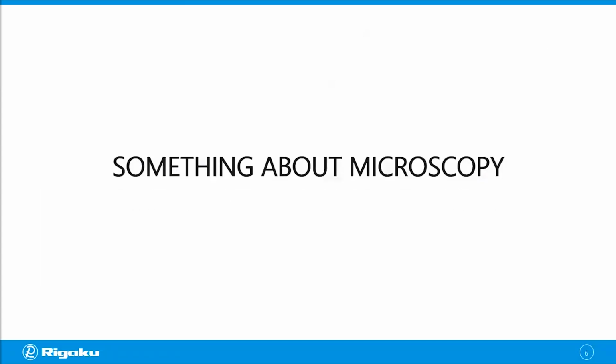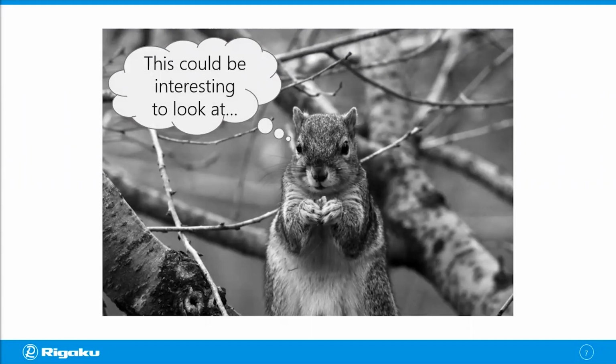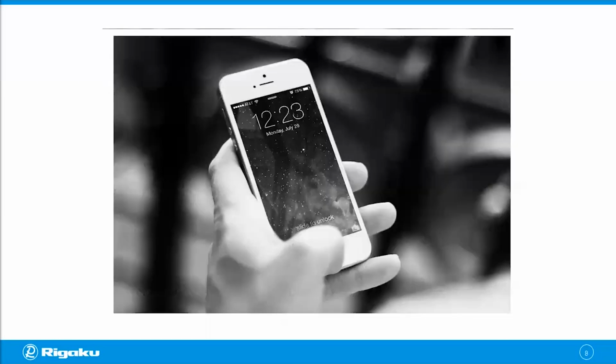So there is something about microscopy nobody told me when I was getting into it. And I think that this is the case for any microscope, not just X-rays. Once you start using a microscope, everything starts looking like a potential sample interesting to scan. For example, I would look at my phone and think, oh, I can scan this.